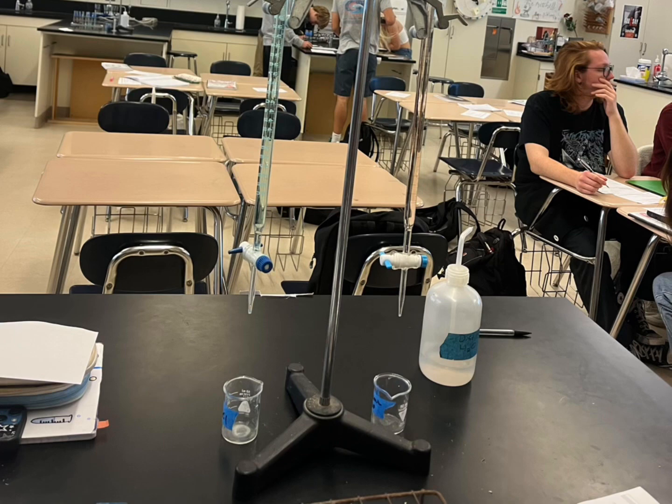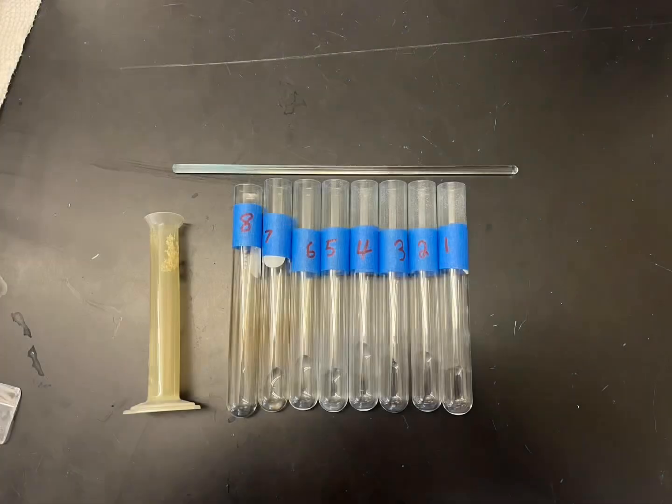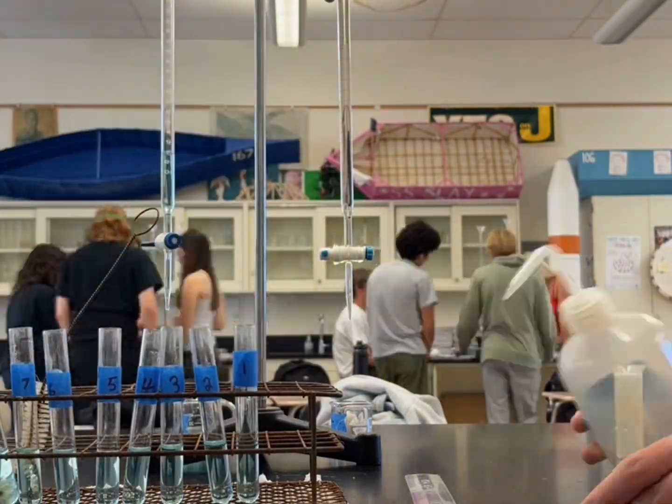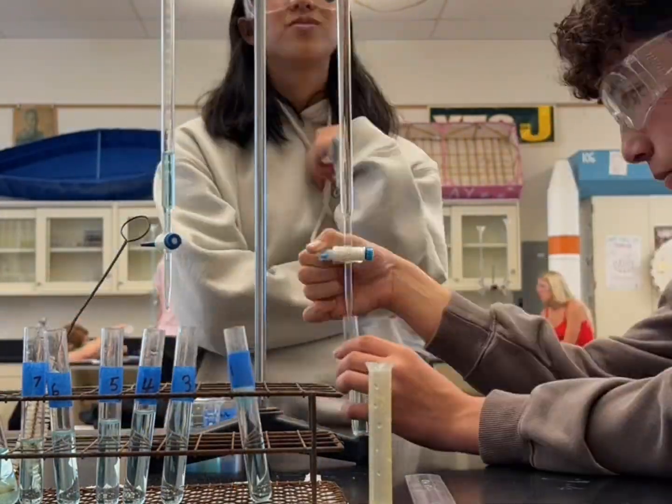For this lab, we used 2 burettes, 1 stirring rod, 8 test tubes, a graduated cylinder, 2 beakers, 2 funnels, and a test tube rack. We first started by cleaning all the lab equipment with distilled water to prepare it for the lab. We then filled 1 burette with KOH and the other with CuSO4.